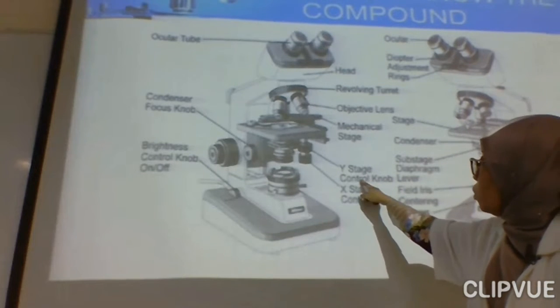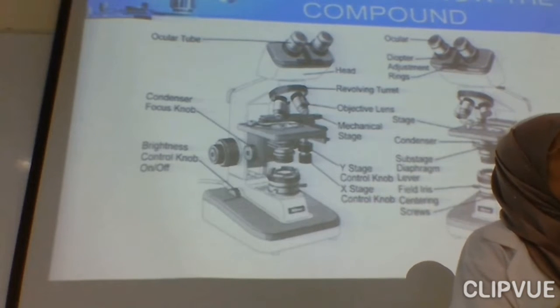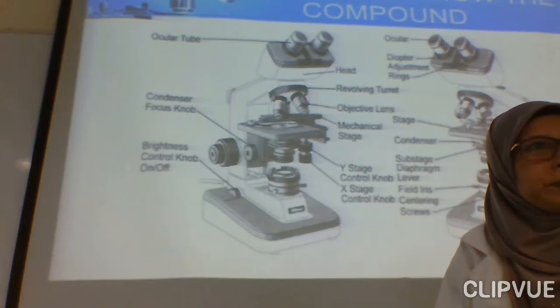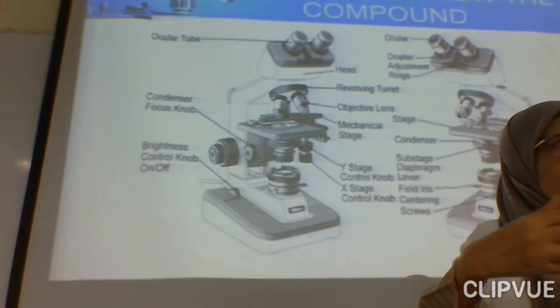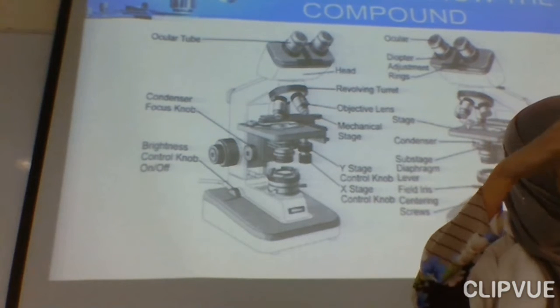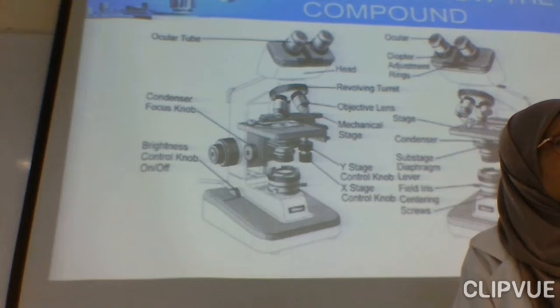Y and X control knobs. Can you turn the Y and X? How is the movement like? Y goes up and down. It's like your graph, X axis, Y axis. Yes, Y is up and down. And then X is left and right. Good, X is left and right.